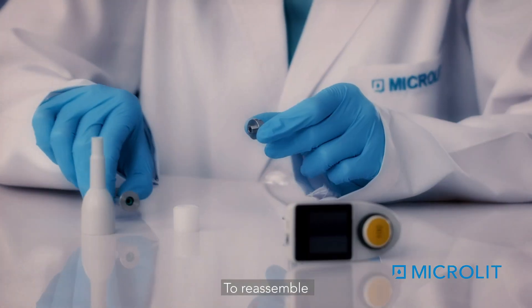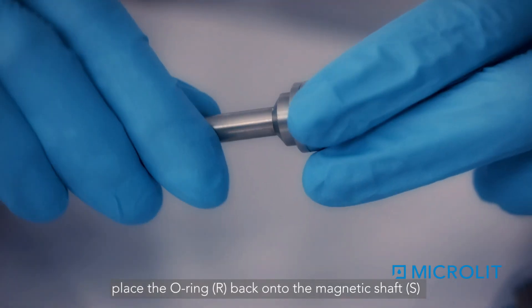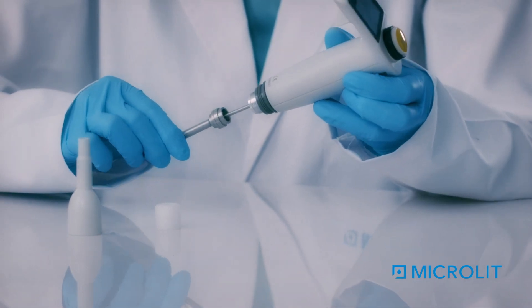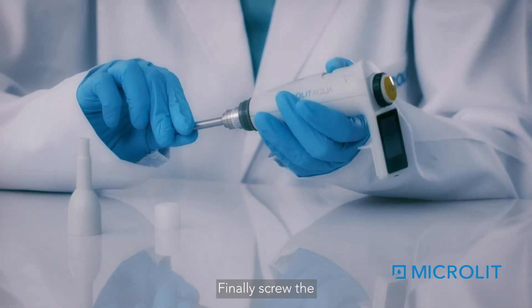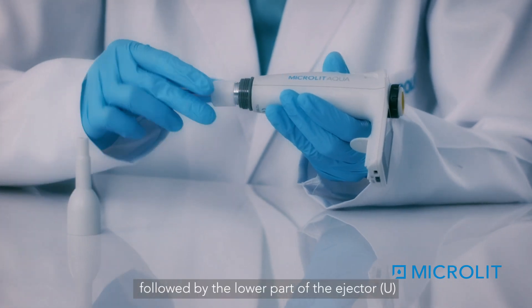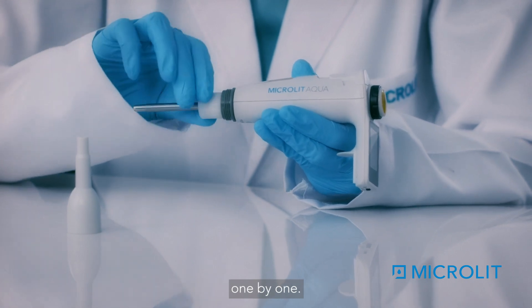To reassemble, place the O-ring R back onto the magnetic shaft S and put them back. Finally, screw the shaft nut T followed by the lower part of the ejector U into the upper part of the ejector O, one by one.